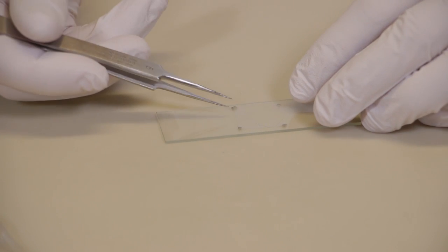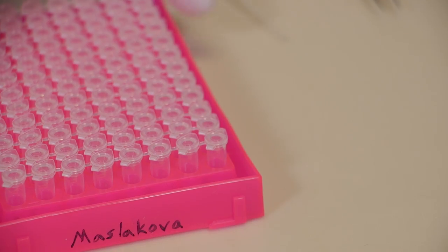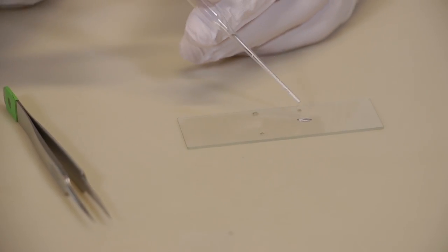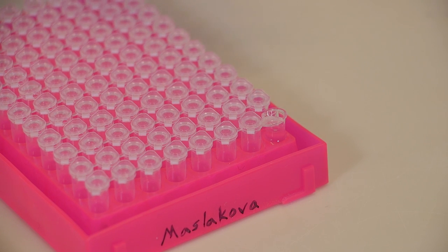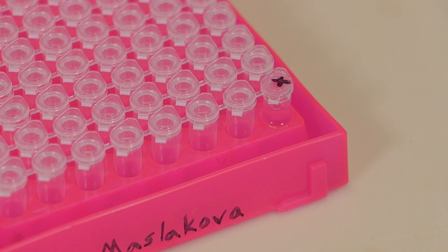Once you have looked at the live larvae and photographed it, you'll want to preserve this individual for DNA barcoding. Use a pair of forceps to carefully lift the cover slip off the larvae. Open a tube and fill it with preservative such as 95% ethanol, then pipette your larvae with as little water as possible into that tube. Pipette it up and down to make sure the larvae gets into the tube, and then check to see that the larvae is in the tube — you may want to examine it under the dissecting microscope just to verify. Now close the tube and label it in such a way that you can match the specimen to the photographs.